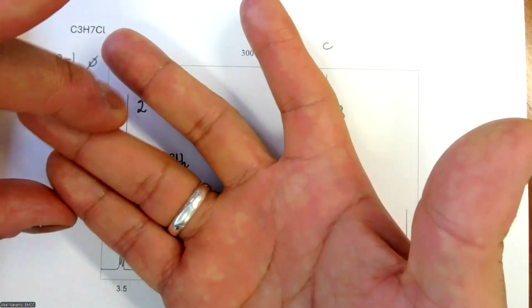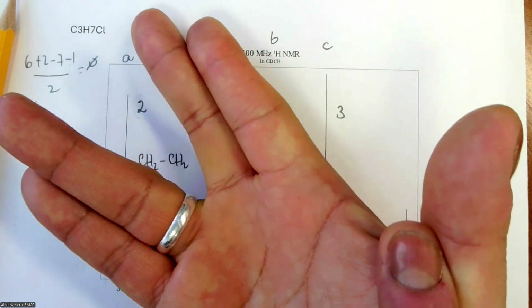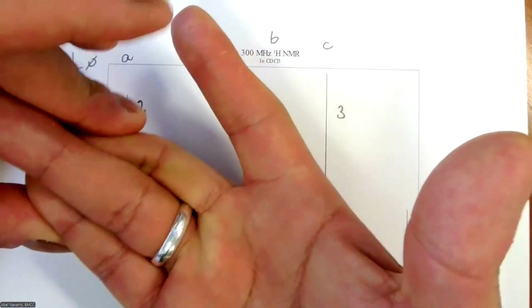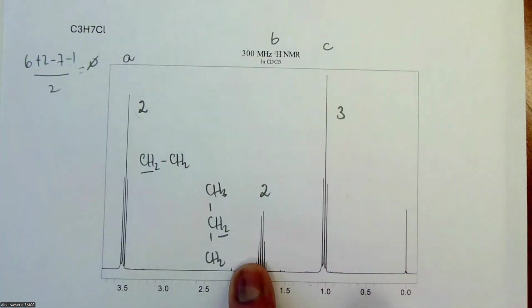Oh, professor, can I have CH2, CH2, and CH? Yes, you can also have that. But how likely is that? Very unlikely. It's more likely to have CH3 and CH2. Okay, so that means that this guy is going to be a CH2 next to a CH3 and a CH2.